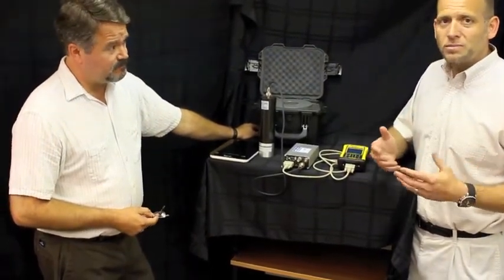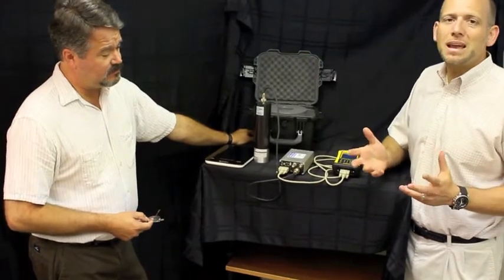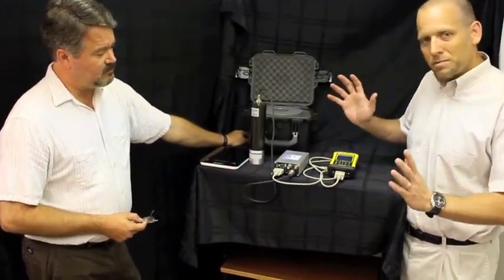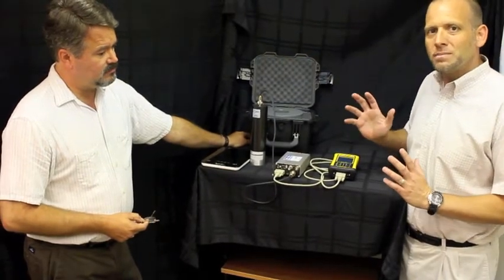This small kit fits in one Pelican case, about a hundred pounds, and is fully battery powered and can be taken out in the field to provide what we consider the world's leading analysis sampling. This kit fits in one Pelican case about a hundred pounds and is fully battery powered.